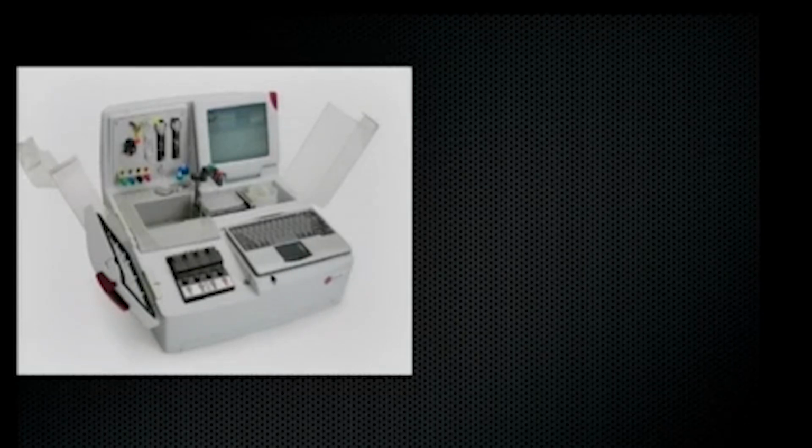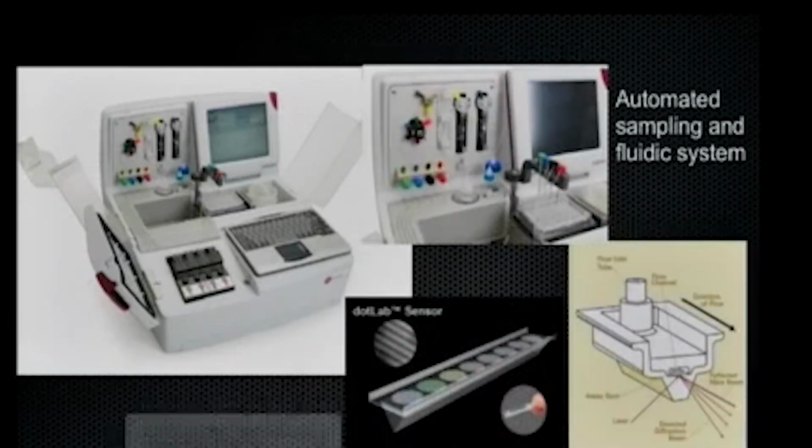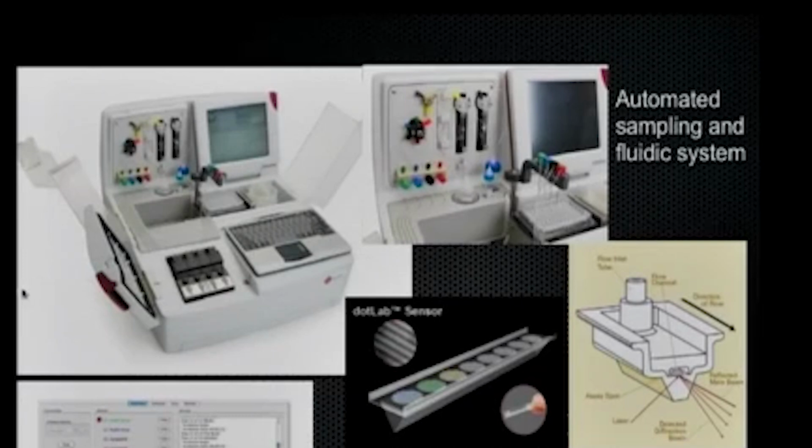It's all computerized. There's a pumping system inside. There's software. And it has the little sample cell that has 8 spots in it that you can put down different proteins or different snippets of DNA or whatever biomolecule you're trying to assay. So now you are providing the multiplexing capability? Yes, it has multiplexing here. Instead of on top of each other, it's now in 8 different spots.